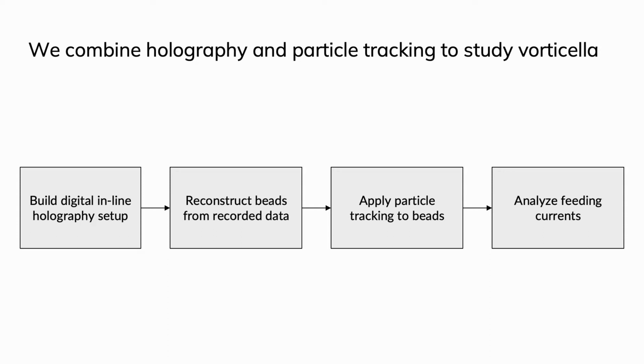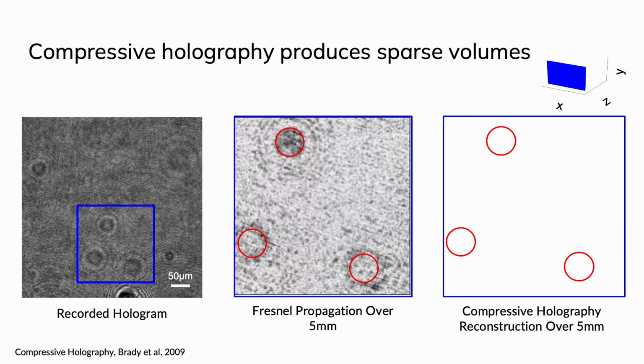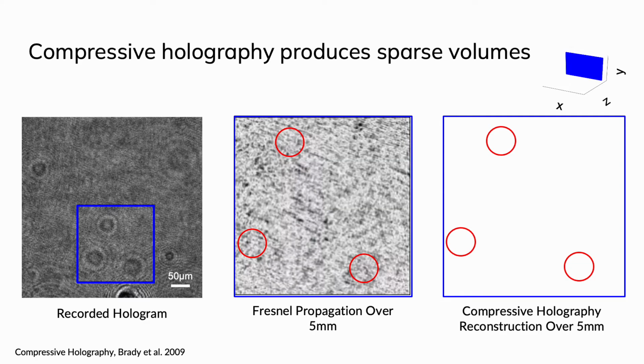We built a digital inline holography setup to record the organism's interaction with beads in water. We use compressive holography to reconstruct the beads and apply particle tracking software to extract bead paths over time. The key technique here is compressive holography.